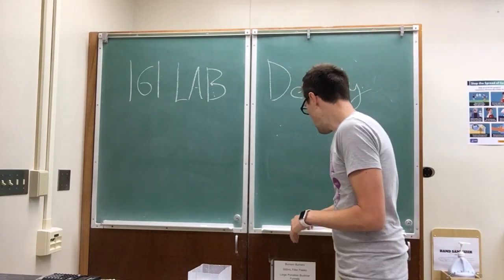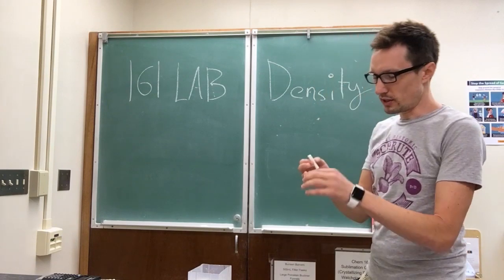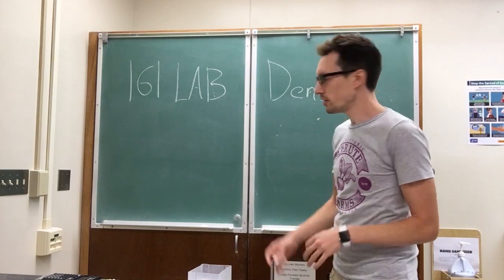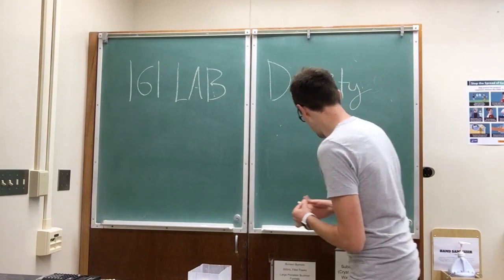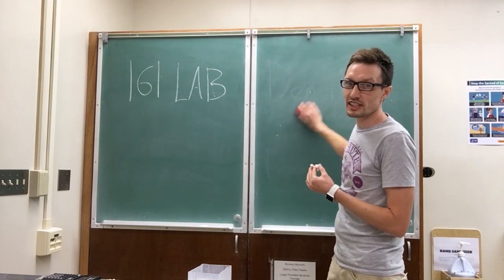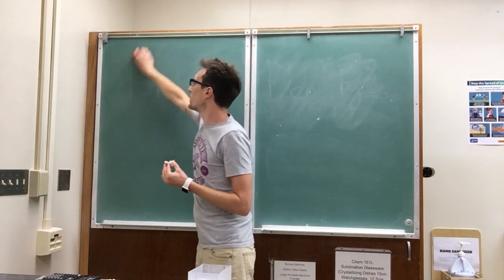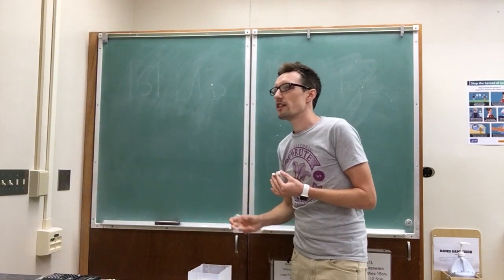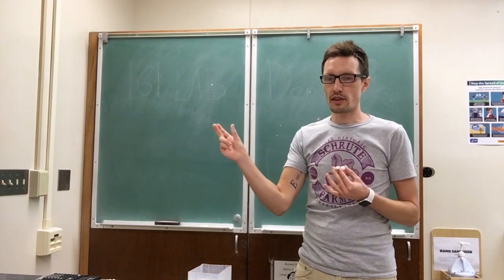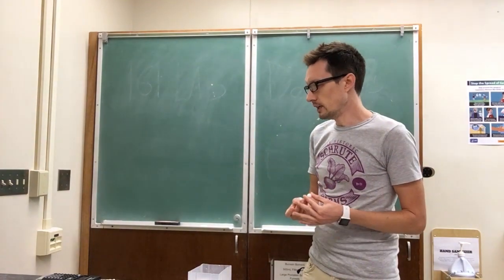So in this lab, these keep going off screen. These little balls, they're made of Teflon. So Teflon is a polymer, and okay, I'm probably confusing you with a lot of sciencey words. A polymer is some sort of molecule where we can take one subunit and make a long chain of them and repeat. We can make it as long or as short as we want, ideally.